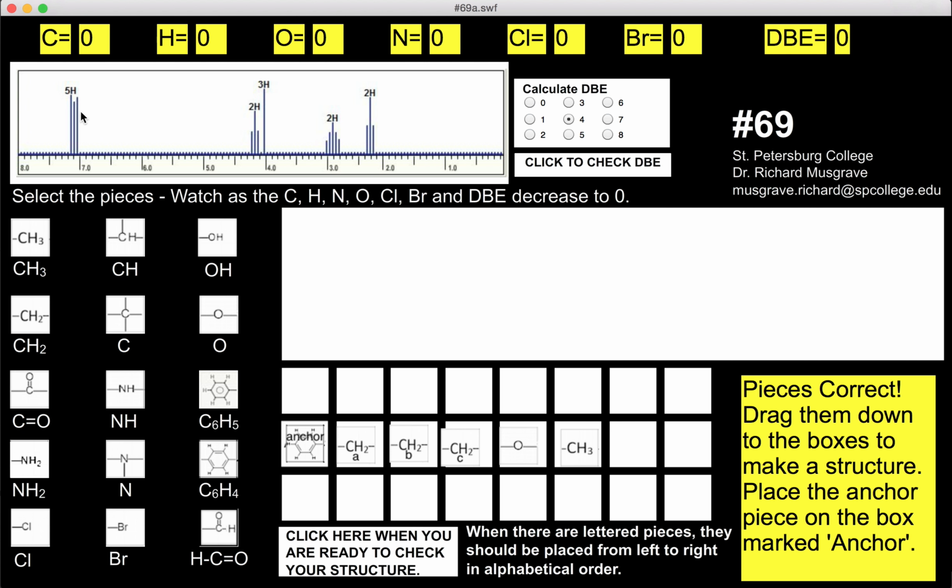In our case here, we've got an aromatic ring that is not split into 2 separate groups of peaks. We've just got the 1 peak grouping here, which indicates that it is probably connected to a C group, an alkyl group. So this should be our structure.